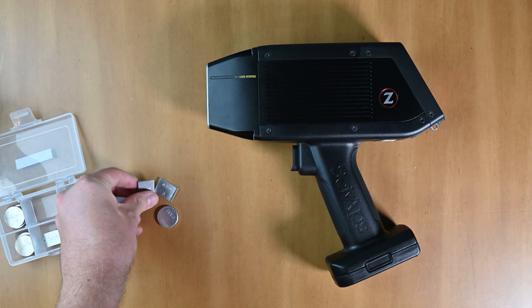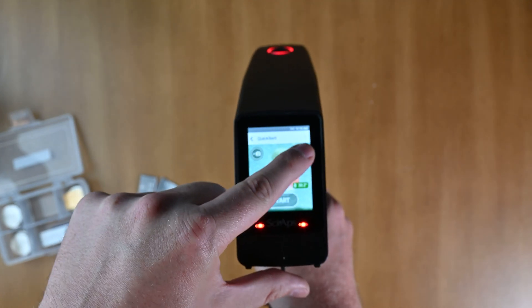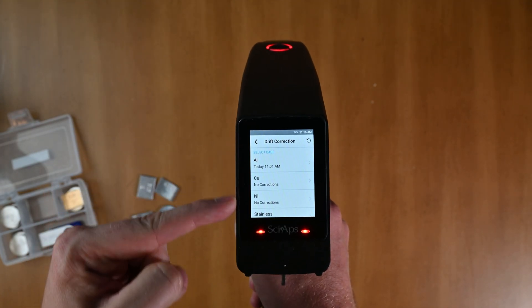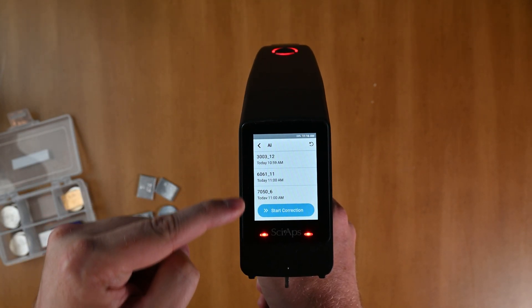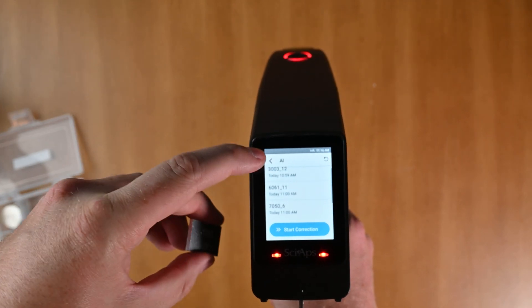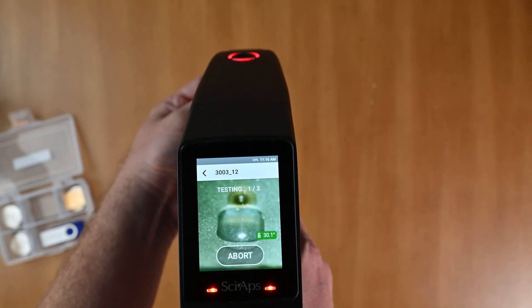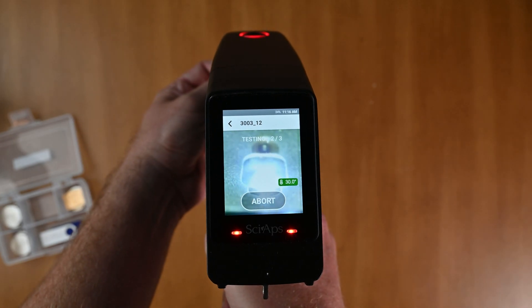I'm going to set these samples down on the desk and take my analyzer. You can see I'm at the analyze screen. I'm going to touch this dot-dot-dot button in the upper corner and select drift correction. It's going to automatically do a little calibration and I get to select the base I want — I'm going to select aluminum. The first one on the list is 3003, so I'll select that, put the sample in front of the analyzer, find a clean spot, and run it. The sample is automatically run and the drift correction happens behind the scenes.